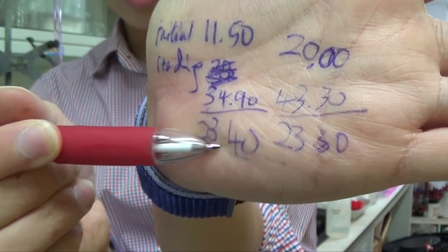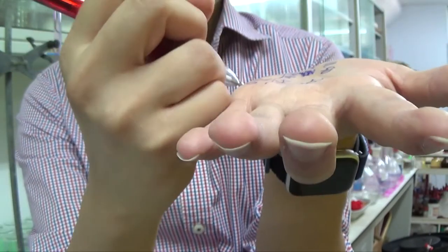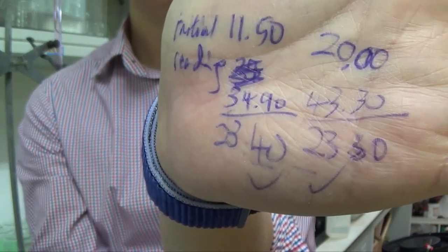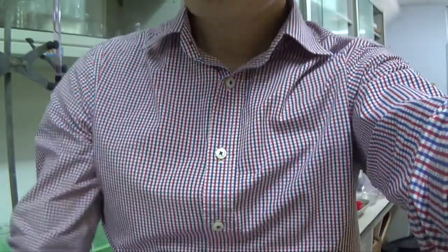That is just slightly lesser than the first, but these two are within plus minus 0.10 cm cubed of each other. So that is what we call concordant titers, titers that are consistent within plus minus 0.10 cm cubed of each other. In O level specifically, concordant titers could be relaxed to like plus minus 0.20, but if you are doing A level chemistry, your concordant titer must be accurate to plus minus 0.10 cm cubed. So you need to be aware of what level of standards are required for O level versus A levels, but it's always best if you can maintain your concordant titers to be within plus minus 0.10.